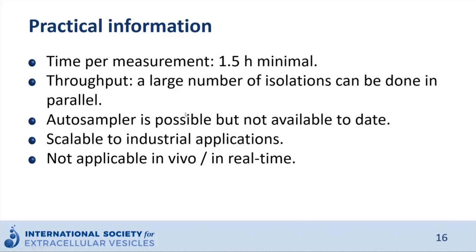So in summary of the practical information, the PEG method requires only 1.5 hours at minimum to complete each isolation. And it allows a large number of isolations performed in parallel.